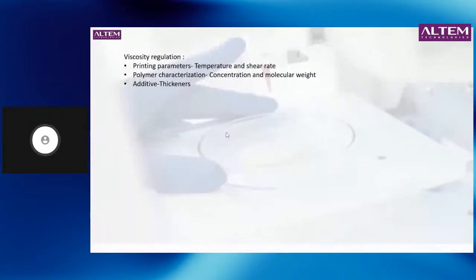Then you have polymer characterization. Concentration and molecular weight are two things that are playing a role. So in terms of polymer characterization, you have concentration and molecular weight. Then you have additives, which are thickeners, right, which have all a direct impact on the viscosity.